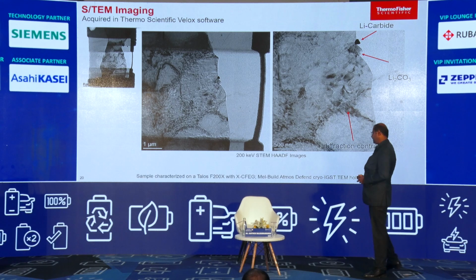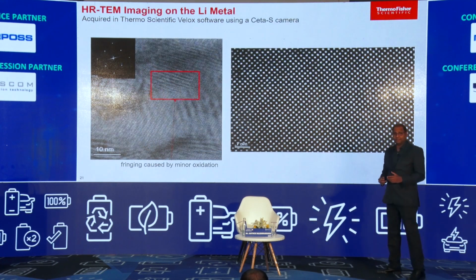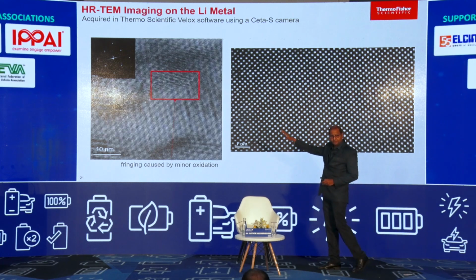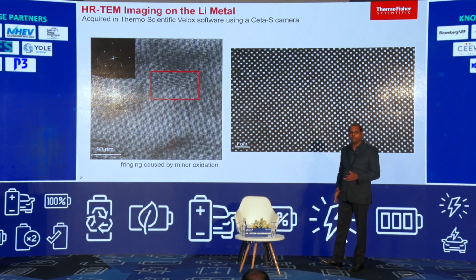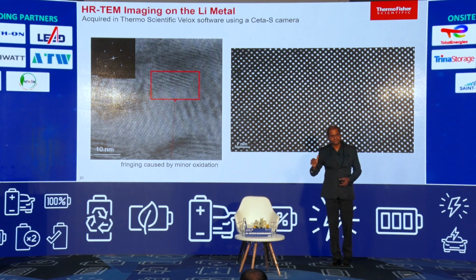So the dark field images clearly show a diffraction contrast coming out of the areas of interest. And if we go further on the magnification, it very clearly shows atomic resolution. The moire fringes that you see on the image on the left-hand side could be partially due to the slight oxidation that has spread across the layer. And a zoomed image shows the presence of clear lithium atoms.